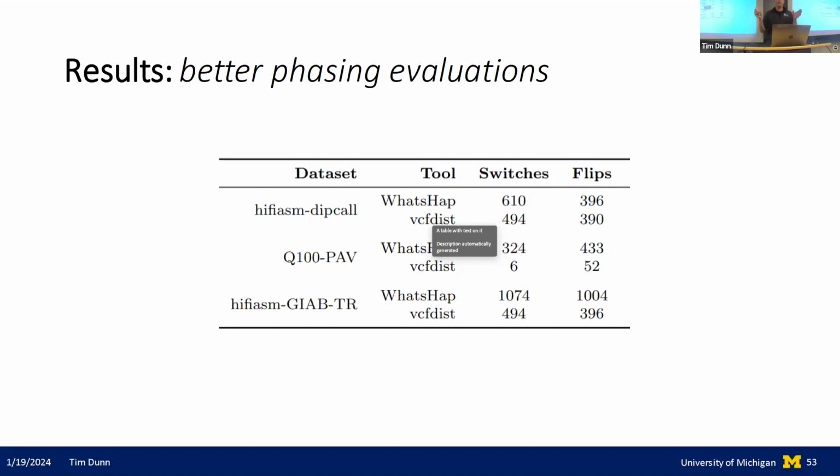The reason this happens is if you are doing your sequencing and there are a few variants over here and a few over here, and you don't have any reads that span from one set of variants to the other, then you can't link the 2 together effectively and say whether or not they happened on the same copy. And so we can use this variant comparison tool to tell whether or not the variants were on the correct haplotype or not.